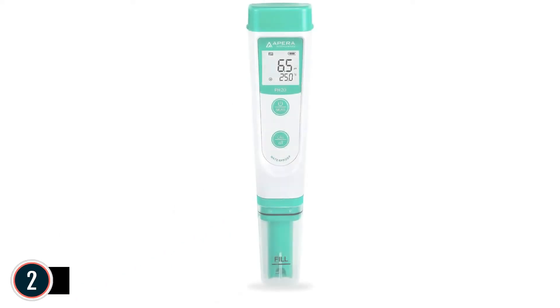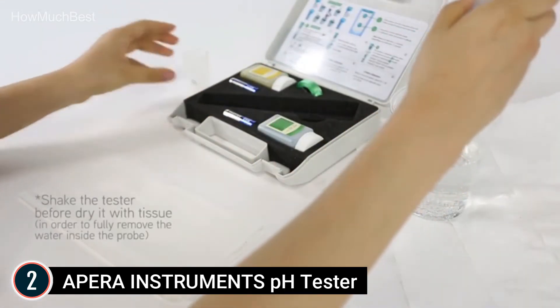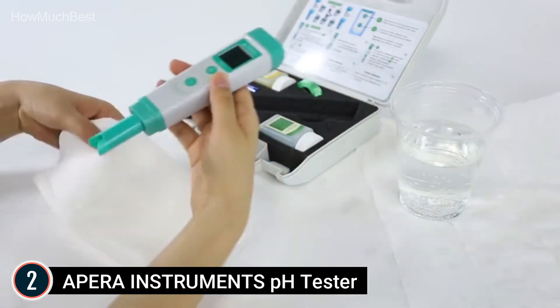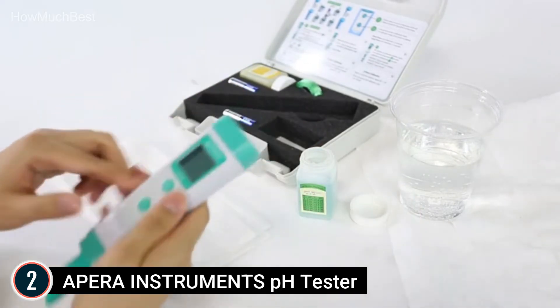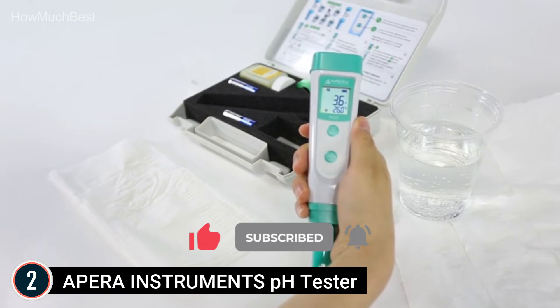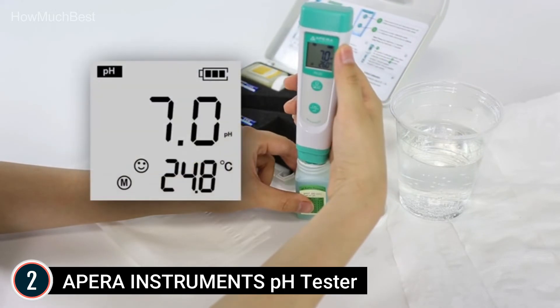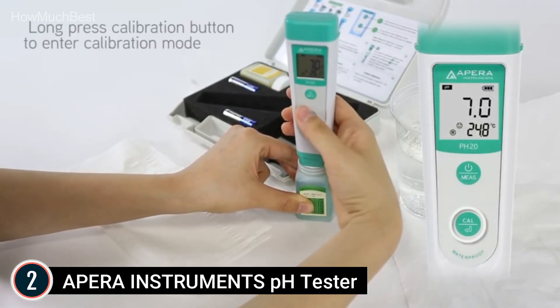Number 2 in our list: APRA Instruments pH Tester. Easy auto-calibration with buffer recognition. Auto temperature compensation (ATC) ensures accuracy across temperatures of 32 to 122°F, backed by APRA's quality pH sensor with low impedance ensuring a high response rate. It comes in a sturdy carrying case with pH 4 and 7 buffers and a lanyard. Auto recognition of stable values improves consistency. Up to 2,000 hours of continuous operation powered by AAA batteries. Simply the most trusted pocket pH tester with the best value for general-purpose pH testing — hydroponics, gardening, swimming pools and spas, water treatment, beverage production, education, and environmental monitoring.